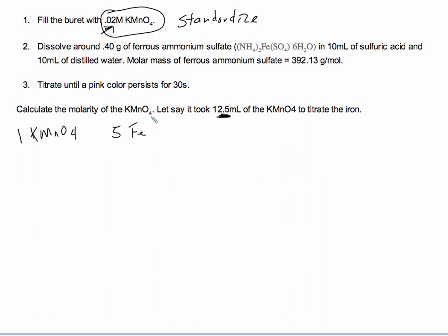All right? So anyway, here's kind of how this all goes. What the students who did the lab did, they started off and they put 0.40 grams of this iron-containing compound. Like I said, the equation that I gave you was very simplified. It didn't have all these ions and things in it, that is, spectator ions. So they put 0.40 grams of ferrous ammonium sulfate, and I don't really like to write the whole formula, so I'm just going to abbreviate it, ferrous ammonium sulfate.